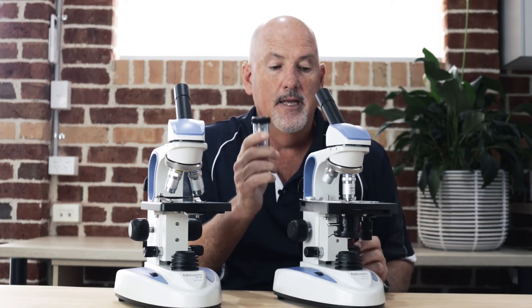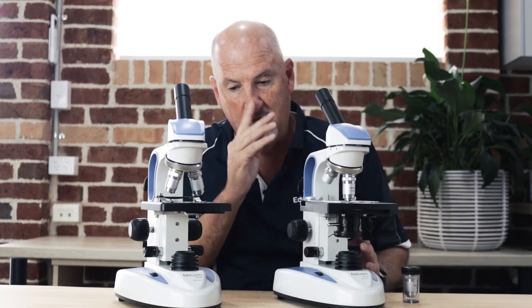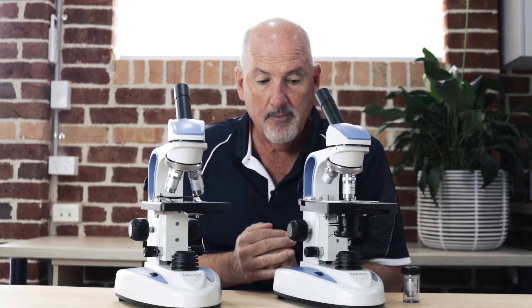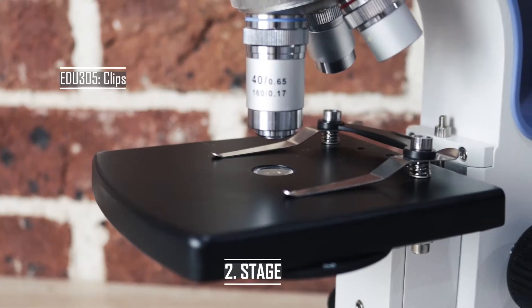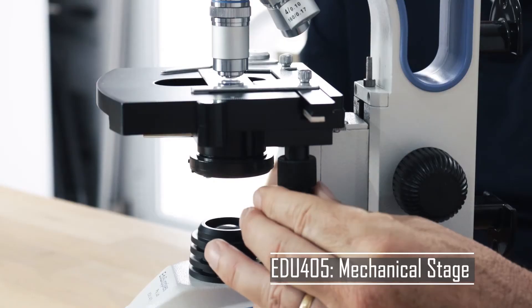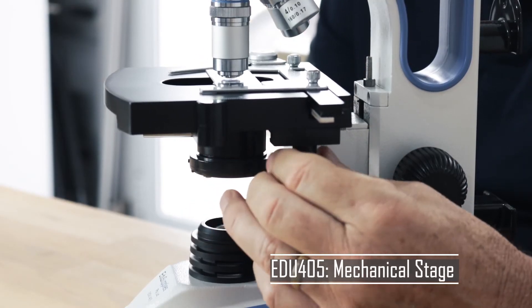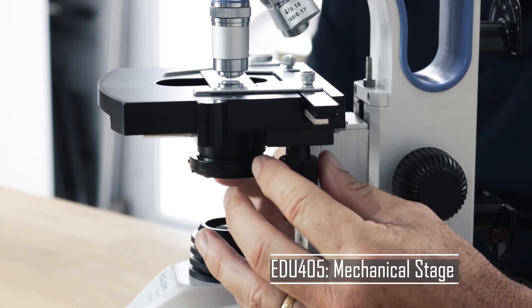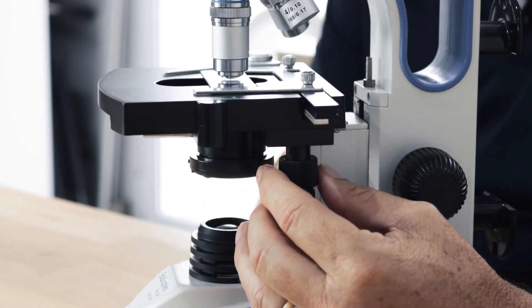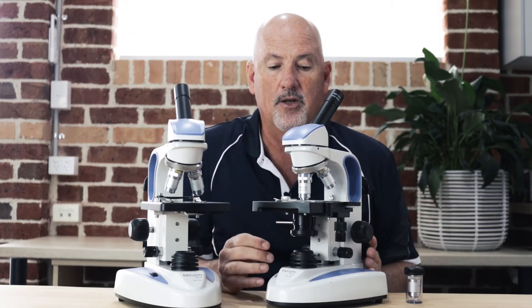This is where this microscope allows us to put the 100x objective on, and you can get a much better image at 100 times where you wouldn't be able to do that with the 305. The other difference is the 305 has clips here, whereas the 405 has a nice movable stage where you can move the slide around easily. Under high power — 100 times or 40 times — it's so much easier to find the specimen in the slide, so students can find it much easier.